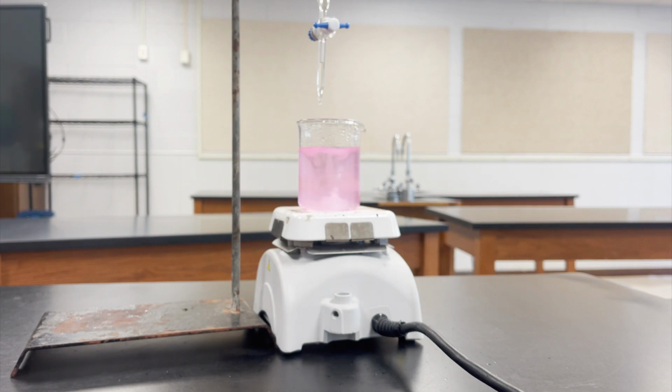All right, it's starting to turn pink and stay pink, but notice how it's really going back to clear. So we're really, really close here. We're really close to the end point. And again, the end point occurs when it turns pink and stays pink.